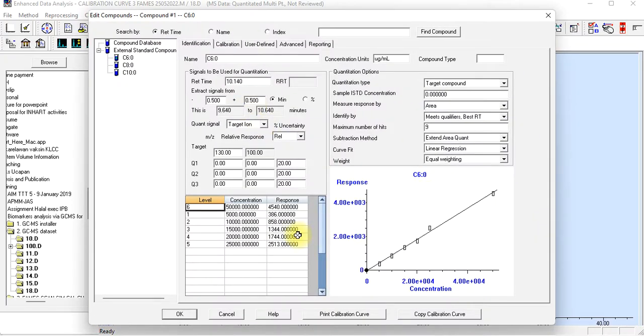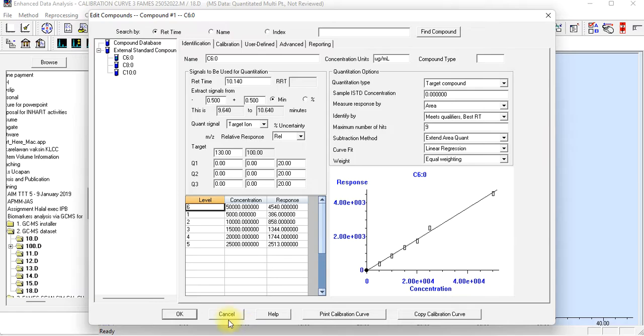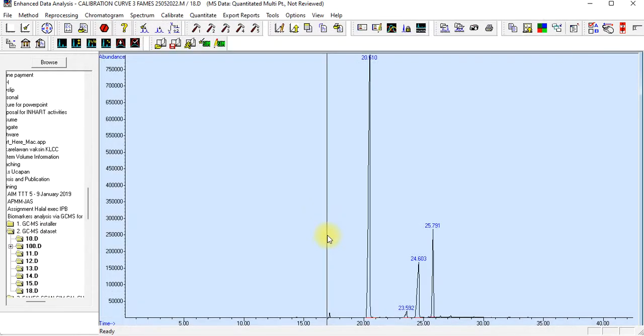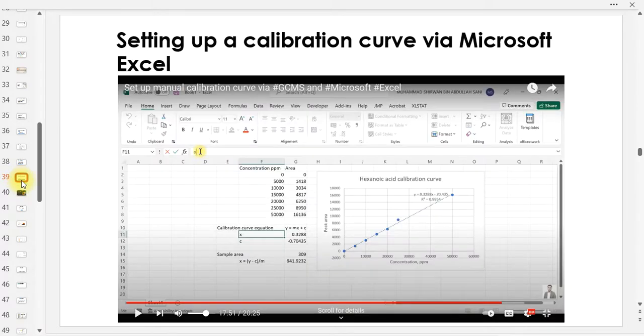We will prefer to use this one. Okay. Up to that part, is it okay everyone? Okay, this is how it looks like. So this is from the YouTube.